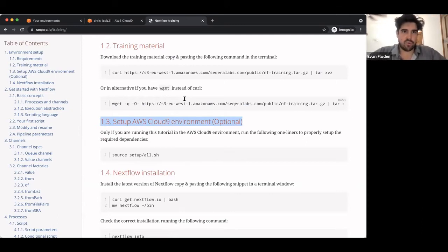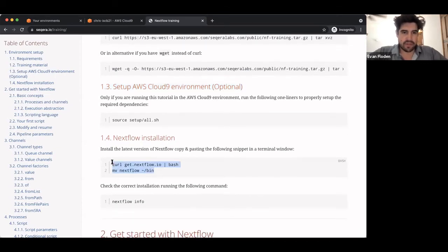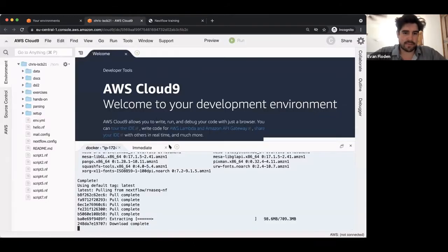Okay. So with that, if you're able to run nextflow info and get this output, that's what should have done the hardest part of the course. I'm on the second to last layer of my container, it's extracting, so hopefully I'm just a few seconds away.